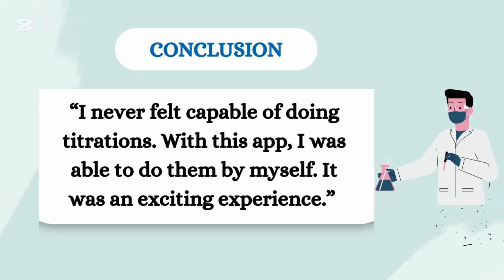The Titration ColorCam app is a powerful tool that transforms a visual limitation into an opportunity for inclusion. Its use in analytical chemistry shows that technology can support multisensory learning and improve equitable access to lab practice. It fosters autonomy, reduces third-party dependence, and enhances students' motivation.